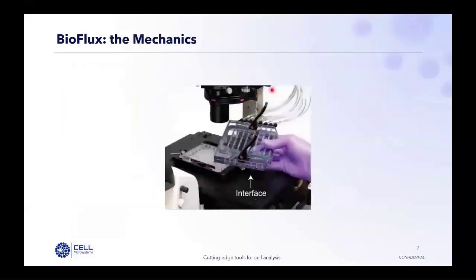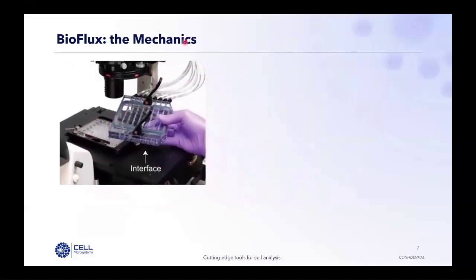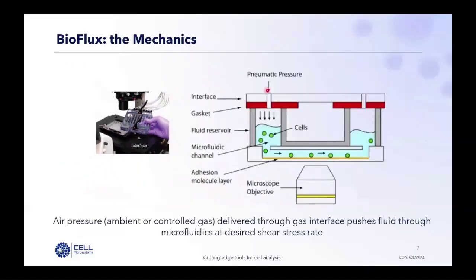The mechanics of the system are fairly simple. The bioflux plates are placed on an inverted microscope to acquire live images of experiments. The bioflux controller pushes air or a custom gas through tubing to move fluids from the wells of plates into the microfluidic channels of bioflux plates.